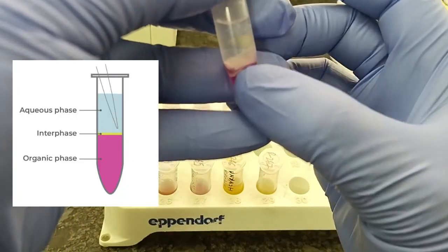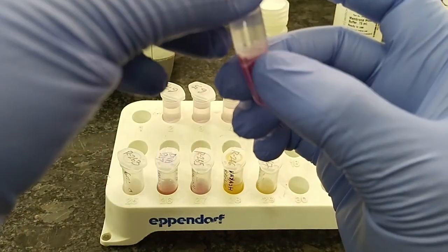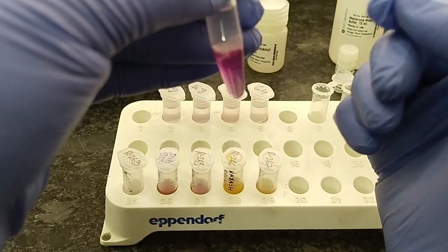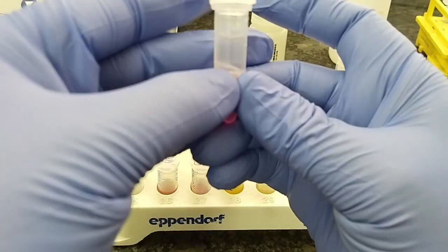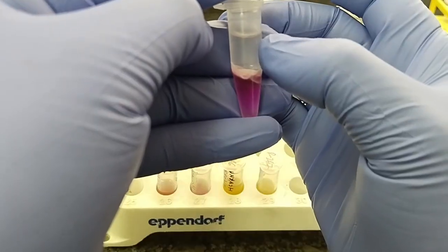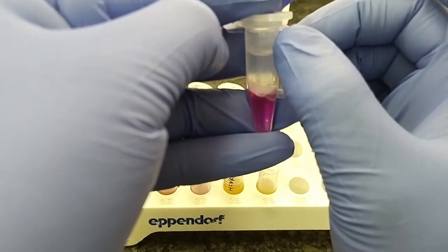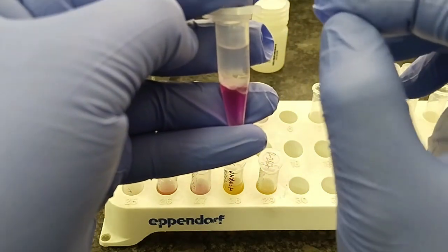This middle portion is called the interphase. Here all the DNA is collected. This pink phase is called the organic phase. Here all the proteins or any other contaminants can be collected. So we have to deal with only this clear aqueous phase. Here all the RNA is collected, and we have to work with this supernatant, this aqueous phase. In the aqueous phase, RNA is present.